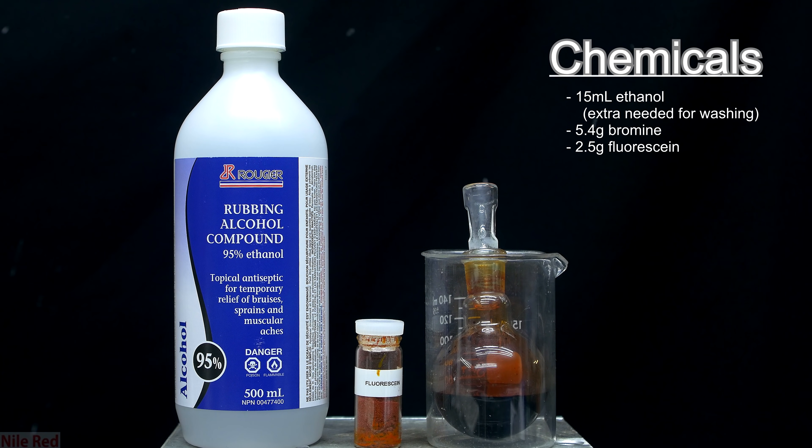So here we have the three main ingredients that we need: some 95% ethanol, fluorescein, and bromine. For the reaction I used 15ml of ethanol, 5.4g of bromine, and 2.5g of fluorescein, but we will actually need a bit more than 15ml of ethanol in total, because there are some washing steps at the end that use it.